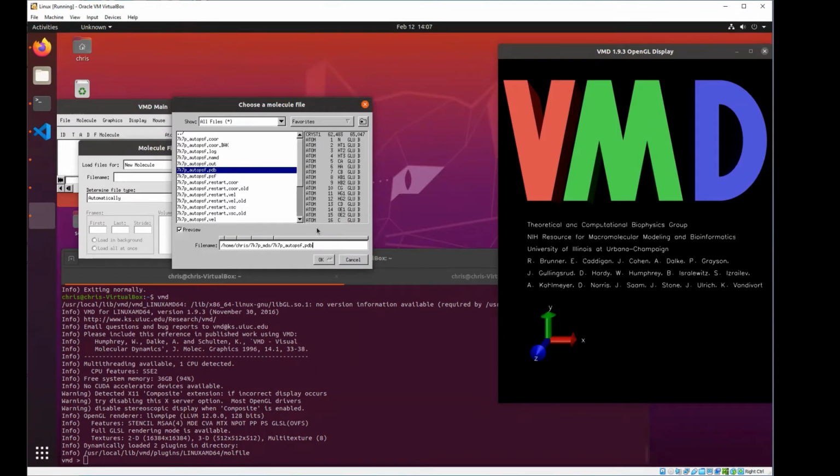When you load new data sets, it kind of has internal memory of what has happened. So sometimes it's better to just start the application fresh, so all its historical information is gone. So if you ever find peculiar errors, just get out of VMD and restart.